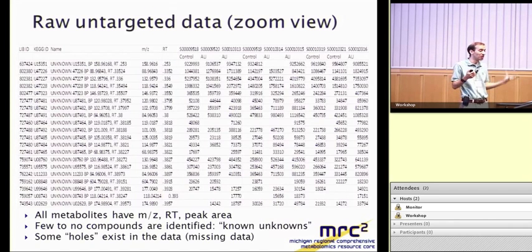So that's something that you have to deal with on a statistical level, because with this sort of untargeted workflow, it's not practically possible to go through manually and look for every single missing peak and say, yes, I can confirm that this is actually missing and it's a zero value and I can put 0 in, or I can put in the lower limit of detection as a proxy for it, or whether it's something that was just in a noisy region of the chromatogram and for some reason was missed. So we can do that on a more targeted basis downstream, but we have to be able to deal with it on a statistical level for the massive data set.